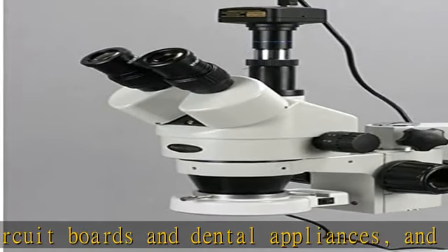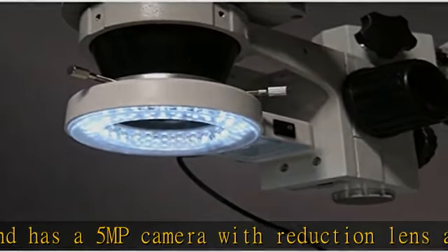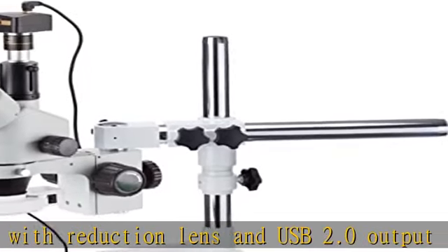360 degree rotation capability to enable sharing. 0.7x to 4.5x zoom objective provides continuous zoom magnification and longer focal length for inspecting large scale specimens.